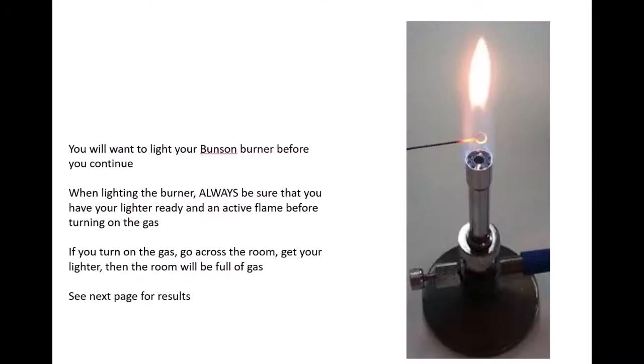Now after we've got our culture ready, we're going to streak it. You're going to need to light your Bunsen burner before you ever start your plate streaking. When you light it, you've got to be sure that you've got a flame going on your lighter before you turn the gas on. Because if you don't, let's just say you turn the Bunsen burner on, there's no safety on these things. Gas just starts coming out. You go across the room, you look for a lighter, you talk to your friends, check your email, text somebody. By that time the room's full of gas. Now you go over there and light that burner and it might just explode the whole world. Maybe not an atomic explosion, but you can actually get killed this way. Certainly burned and it's not a good way to make an A in lab at the very least.